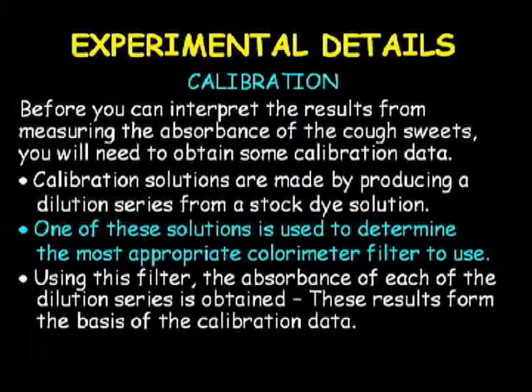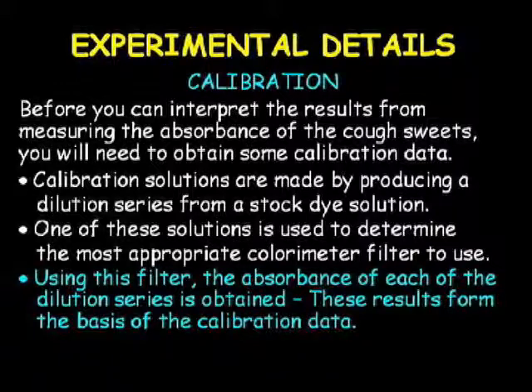These absorbance measurements will enable you to determine which filter should be selected for use in the remainder of the experiment. Using the selected filter, the calibration data will be obtained by measuring the absorbance of each solution of the dilution series.